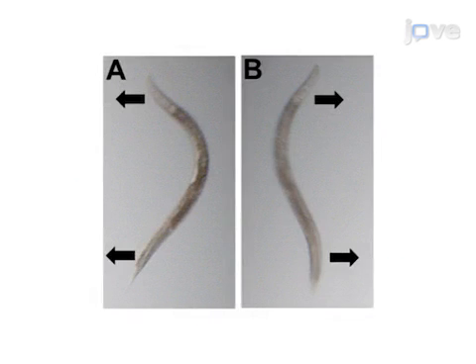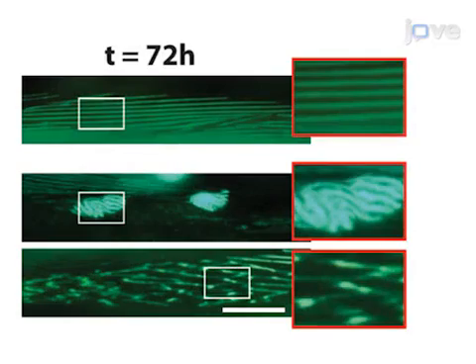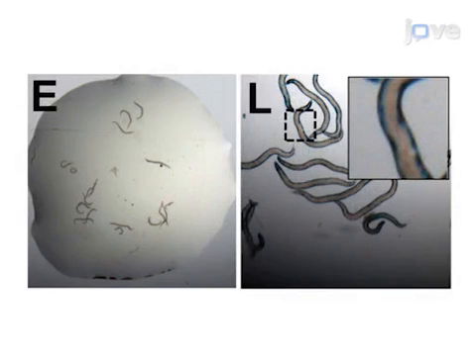The results show whether defects in subcellular compartments of muscle may be responsible for movement defects based on abnormal appearance of mitochondria or sarcomeres, abnormal uptake of dye into mitochondria, and/or abnormal protein degradation. These methods can answer key questions about muscle physiology, such as which genes contribute to movement and why. Though these methods can provide insight into the effects of mutations, drugs, or RNAi treatments, they can also be employed to look at the effects of aging.